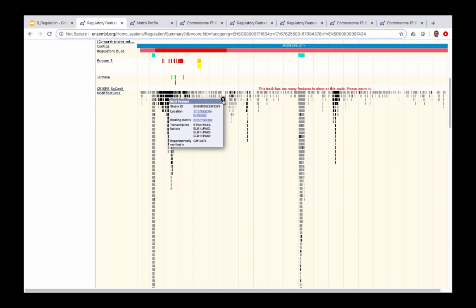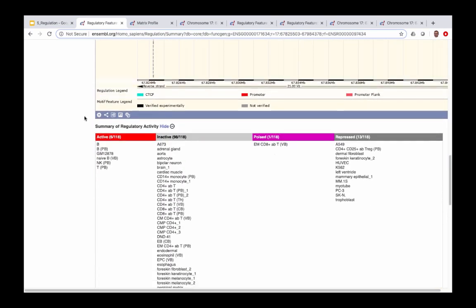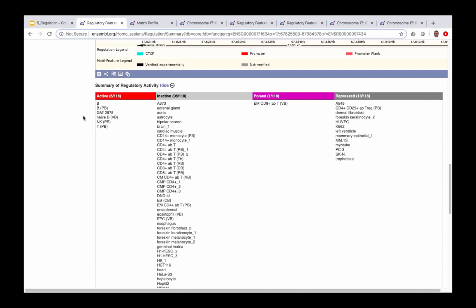Going back to the Ensembl genome browser, scrolling to the very bottom we find a table showing the different cell types and the activity of this feature in each. In 6 of 118 cell types in Ensembl, this feature is active; in 98 cell types it is inactive; in 1 it is poised; and in 13 cell types it is actively repressed.